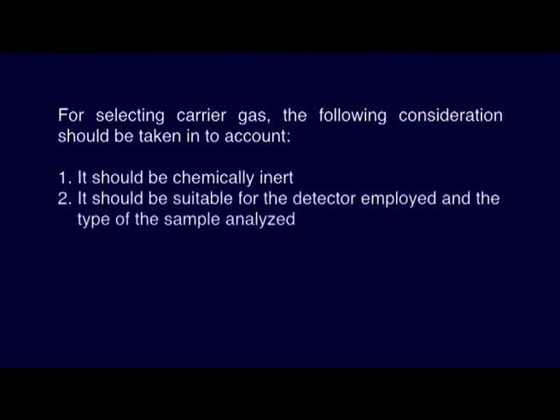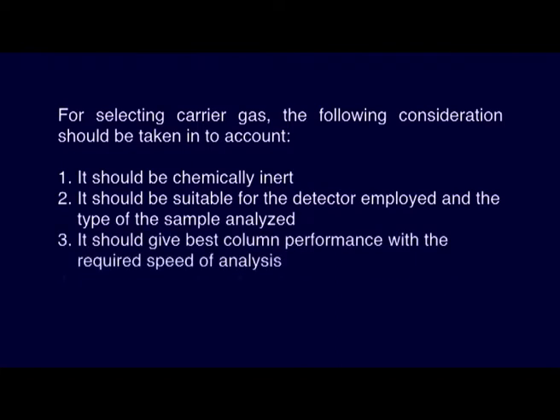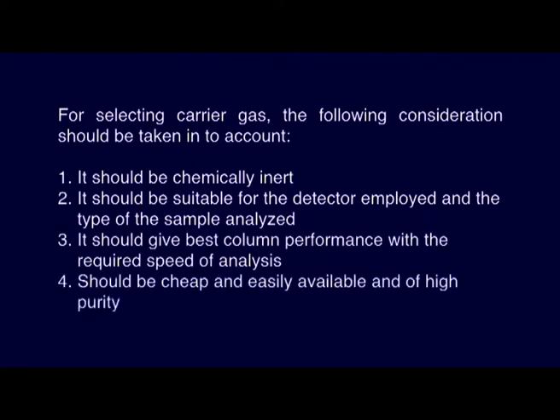The carrier gas is allowed to flow through the system, carrying the sample in the vapor state through the column. For selecting the carrier gas, the following considerations should be taken into account. It should be chemically inert, that means it must not react with the components of the sample, or with the liquid stationary phase. It should be suitable for the detector employed and the type of sample to be analyzed. It should give the best column performance with the required speed of analysis. It should be cheap, easily available, and of high purity for the separation.